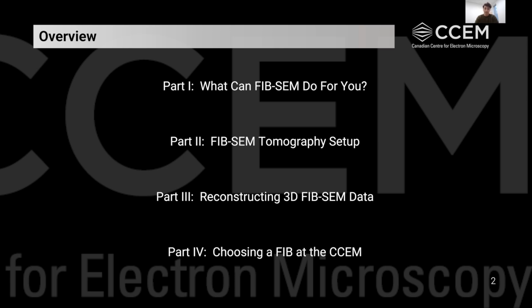In part two, we're going to dive into the microscope, look a little bit at how we can set up a FIB-SEM tomography acquisition. Part three is after we've come out of the microscope, what can we do with our data? And part four is a short introduction to some of the FIBs that we have available at CCEM and some of the modalities that we're able to couple with that FIB-SEM tomography technique.